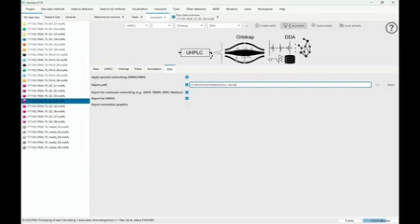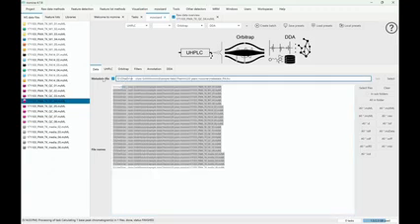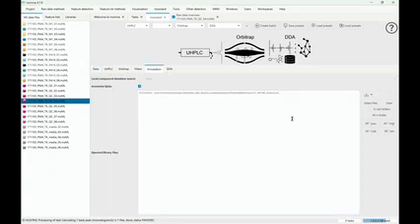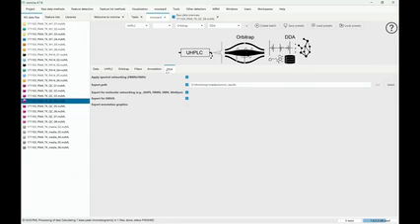So I will just reiterate. We did put the files here. We did put the metadata file. We set some parameters, but even if you miss that, it's going to work. And then the spectral library file, we also selected in the annotation tab, and it was a JSON file.